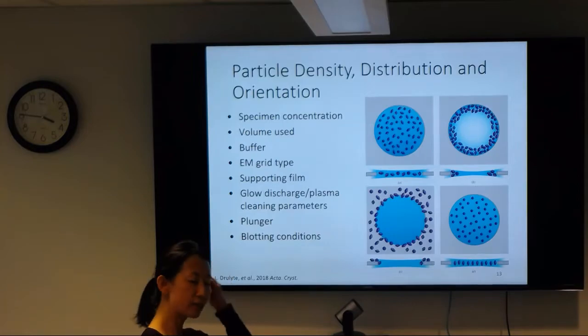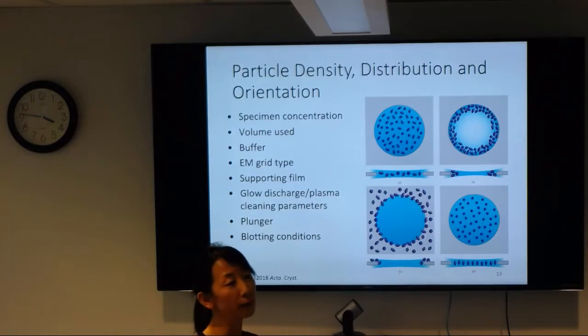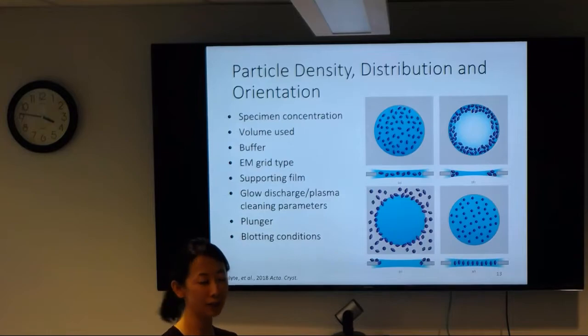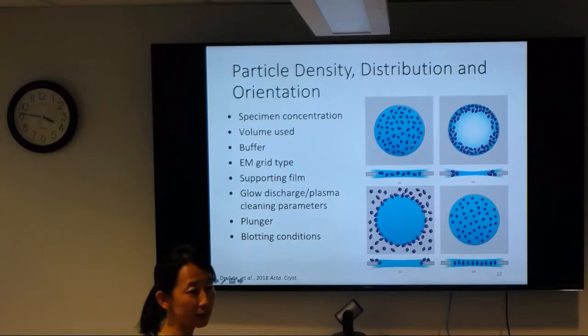This is a little bit of experimental detail, because when you work on a tomography project, you're probably going to spend more time in front of a bench than in front of the microscope, because you want your sample to be perfect before you move to the electron microscope for your pretty images. So this is just an overview. We want to see all our grids like that, right?